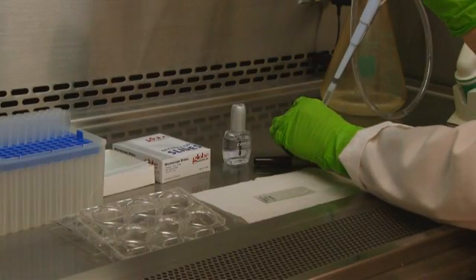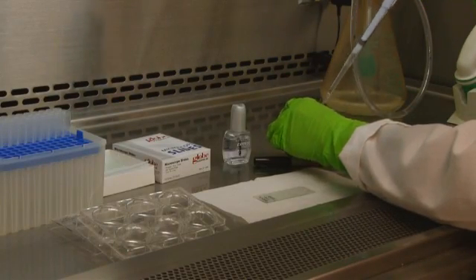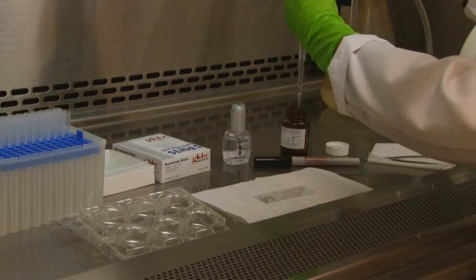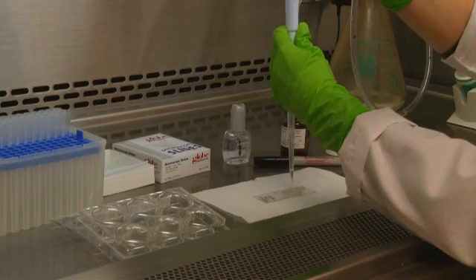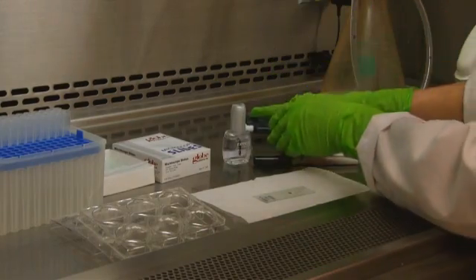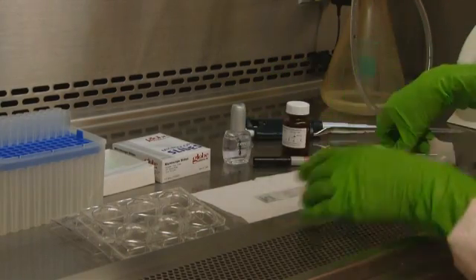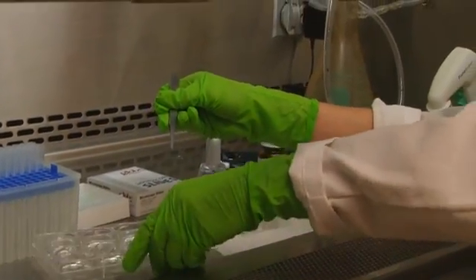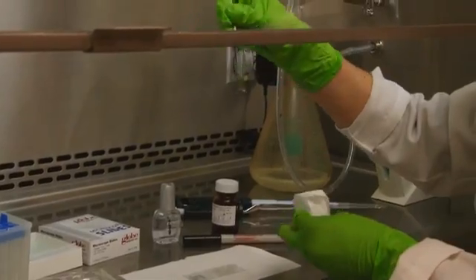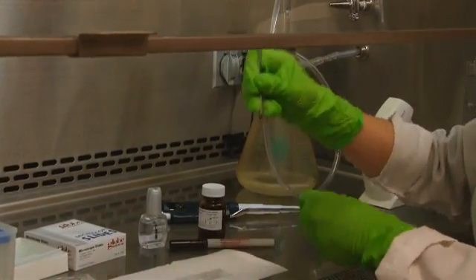Cover slips are now ready to be mounted onto microscope slides. Take a clean slide and dispense one drop of anti-fade mounting medium by slowly dialing down the plunger of the pipette. Carefully remove a cover slip from the well, allow excess wash to drip off, and place the cells face down onto the slide.